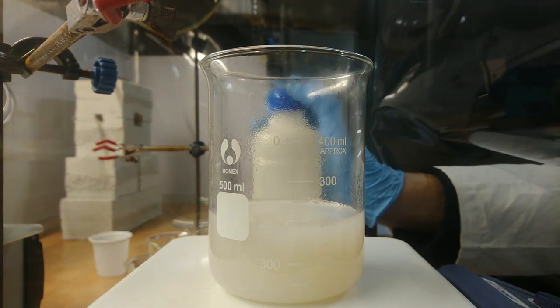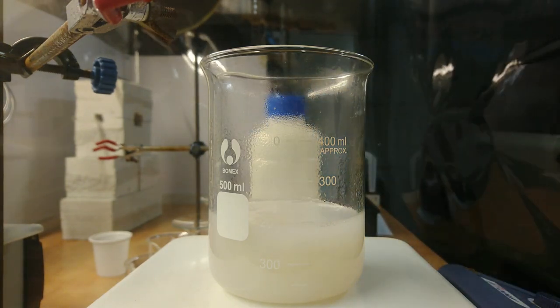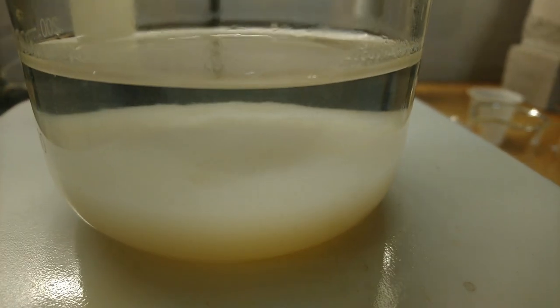Our metatitanic acid forms as a fluffy, whitish, water-insoluble material. After the solution is left overnight, it actually looks like a cloud in a beaker.